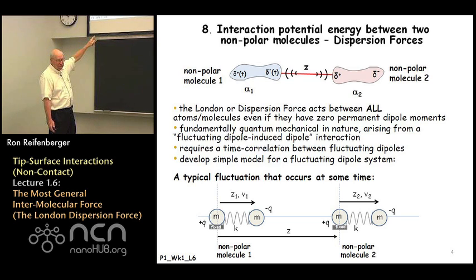There's a mass associated with each spring that's fixed, held in place. There's a second mass associated with each spring system that's free to move. The charges associated with each mass exactly cancel out. So the fixed mass has a charge plus q, and the mass that's free to move has a charge minus q.